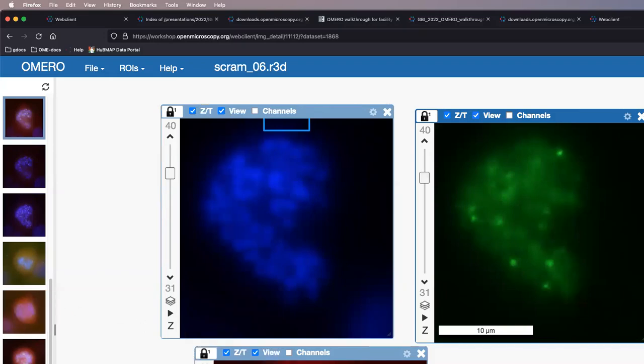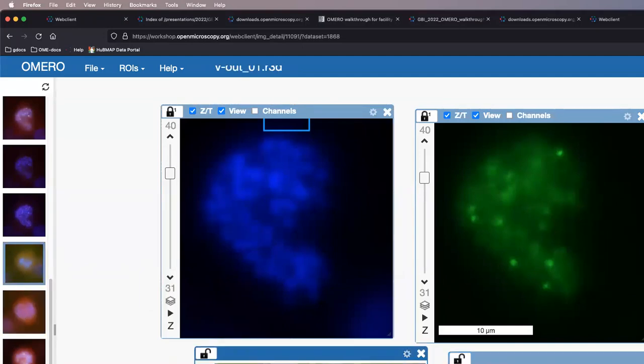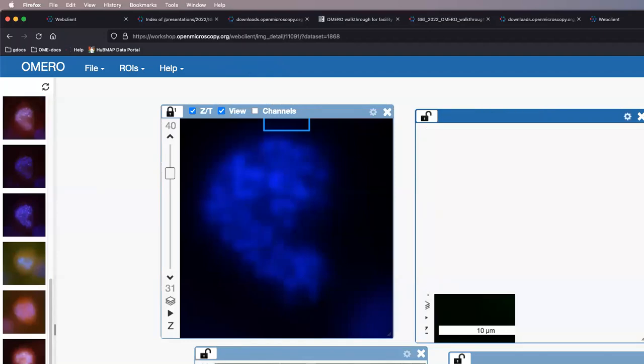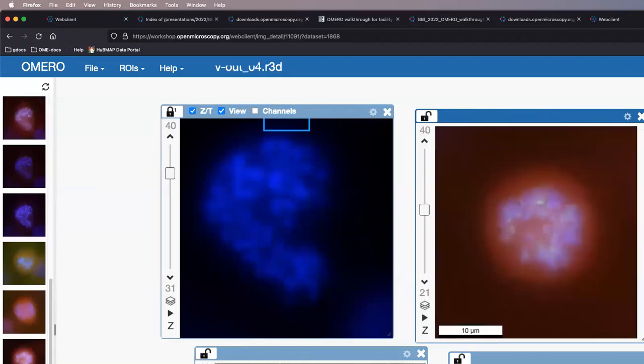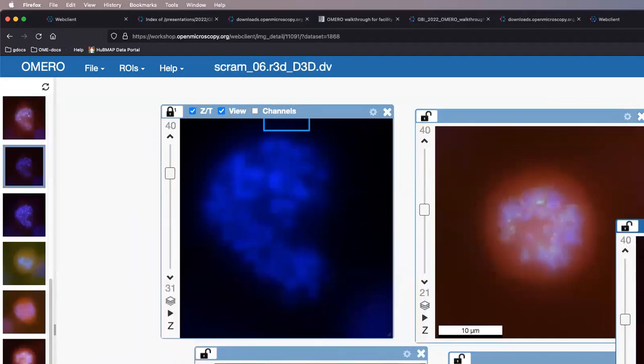Okay, I can now go ahead and compare this image in 3 channels with another image, which I can facilitate by dropping in another full viewer, or dropping another image in the existing window, like so. Or if I select a window, I can click on another image and this will pop the new image into that selected window. This is a single click. Or if I want to use a double click, then I can, and this will of course open a fully new viewer.